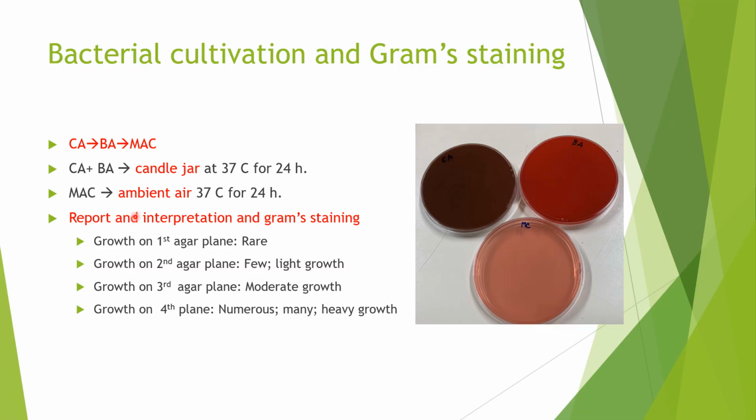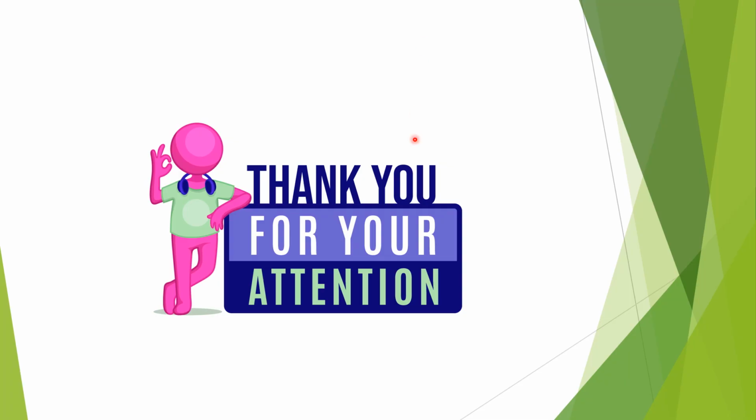When you report it, you can report it as follows. For example, growth on only the first agar plane, you can report as rare. Growth on the second agar plane, you can report as few or light growth. For the third agar plane, you can report as moderate, and the fourth plane can be numerous or heavy growth. And thank you for your attention.